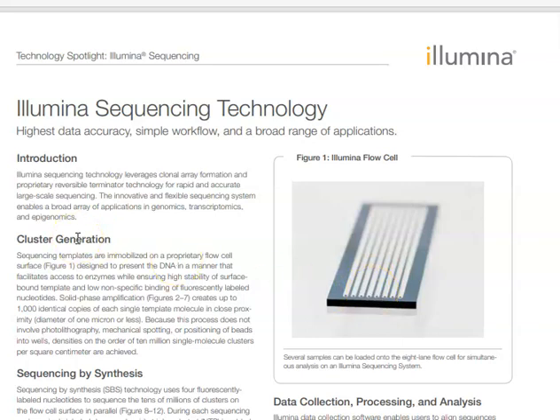Now those oligos come in two different types, and they recognize two different types of oligo on the flow cell. And basically the oligos on the flow cell bind to the oligo linkers that we've added to the end of our fragmented DNA, and that captures the DNA, and then we perform something called cluster generation. And this is, I won't say it's like PCR, but it's a DNA amplification technique that allows up to 1,000 identical copies of a piece of DNA to be created by solid phase amplification. We call that bridge amplification, and I'll show you how that works in this document and in the session, and it's also present on the Illumina video, which you're going to watch next.